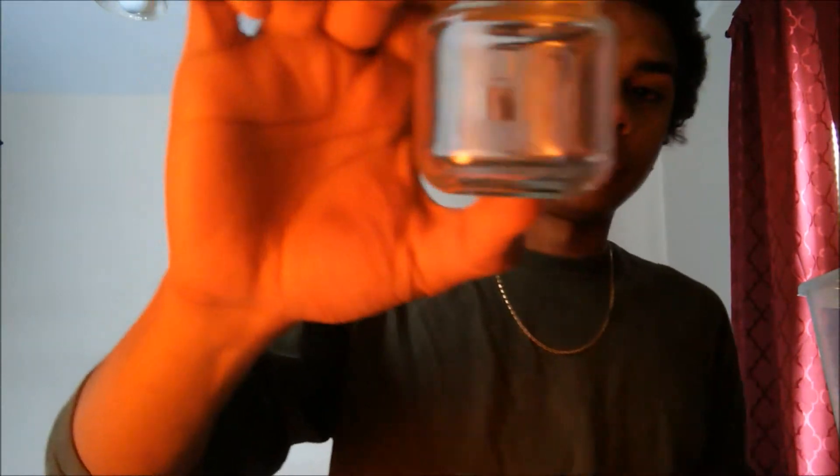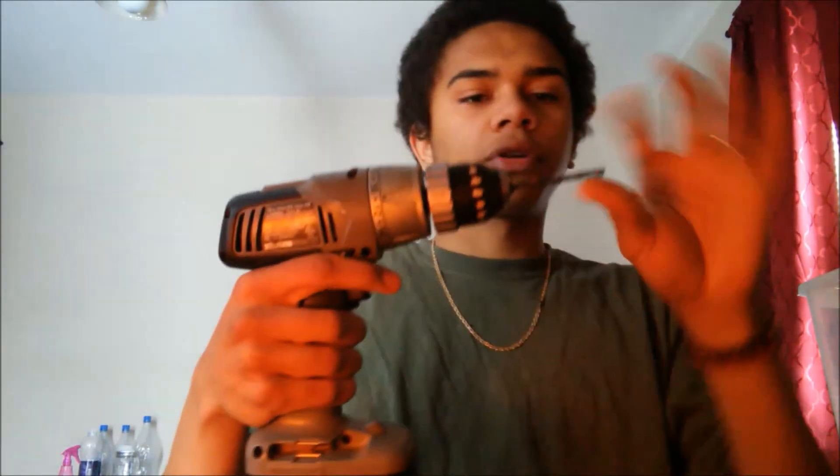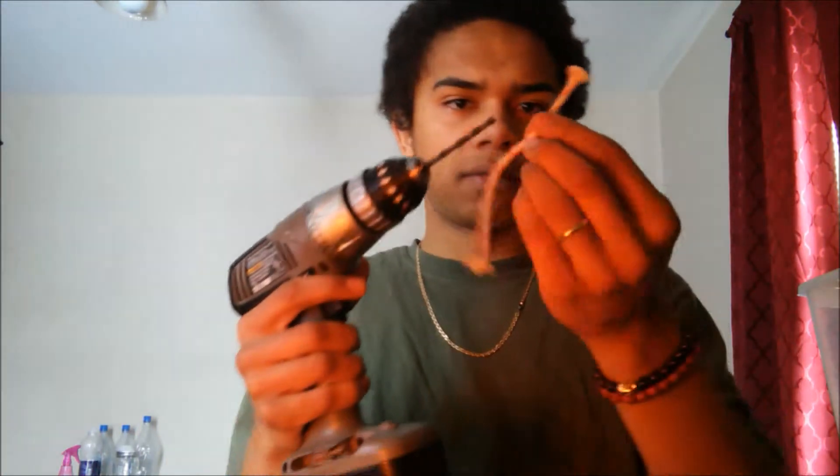Hey everybody, it's Will and today we're making our own alcohol lamp. You don't need that many things. We're just going to use a medium-sized baby food jar, a little piece of wick — or you can use a cotton ball unrolled and rolled up to simulate a wick — and then you're going to need some aluminum foil and a drill with a bit that's about the diameter of your wick.